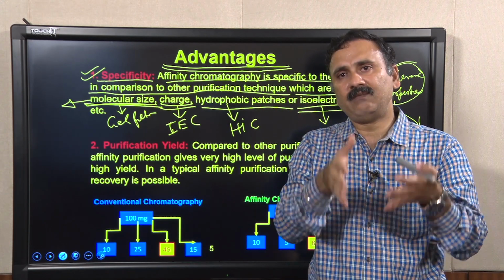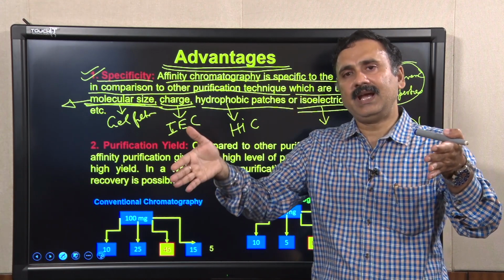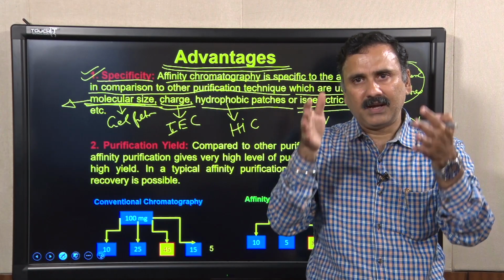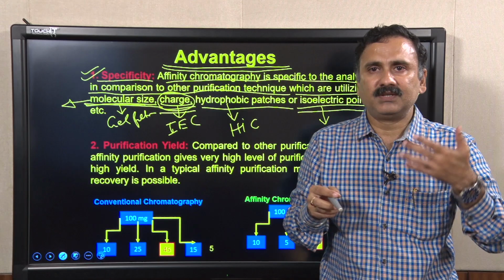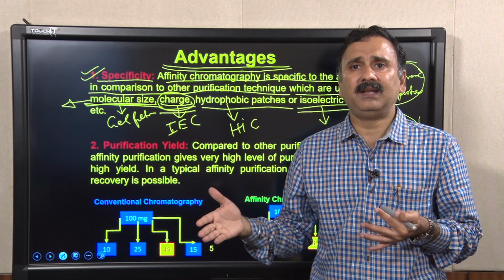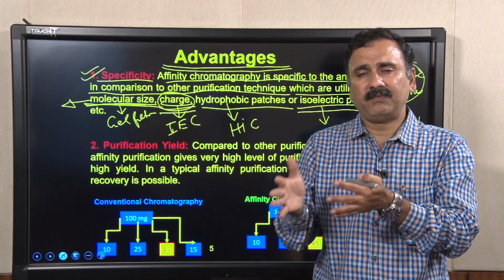It will give you analytes falling within the range of 10 to 50 kDa, so you are going to get multiple analytes. Similarly, with ion exchange chromatography, multiple proteins will have different amounts of charge, and you can use it to purify, but you cannot purify the particular analyte.